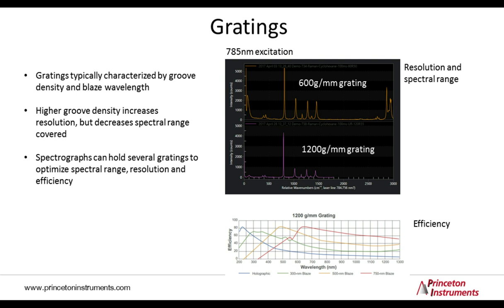The central component of a spectrograph is the diffraction grating. Diffraction gratings are characterized by the groove density and blaze wavelengths. The groove density essentially determines the resolution of the device, but also the spectral range that is being covered. And so it's typically important to find the right balance between spectral resolution and spectral range covered.